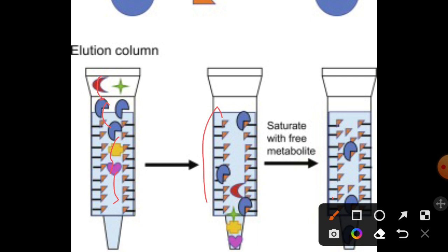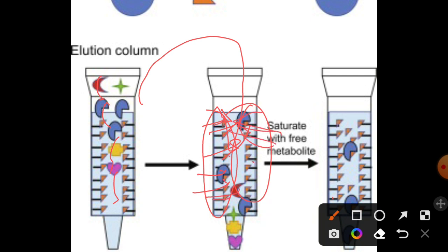As a result, when the mobile phase passes through the solid phase, the substrate ligand will selectively pick up only its desired protein, because it can only bind with the desired protein's active site, and that's how they can provide an extremely sensitive separation with the help of this non-covalent interaction.